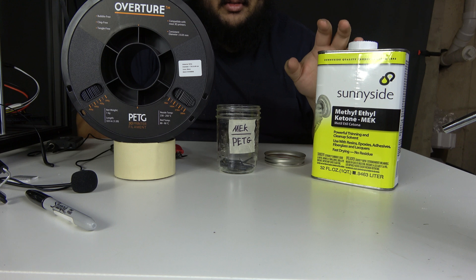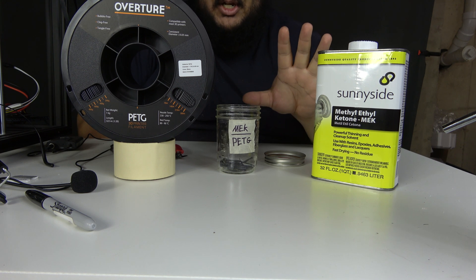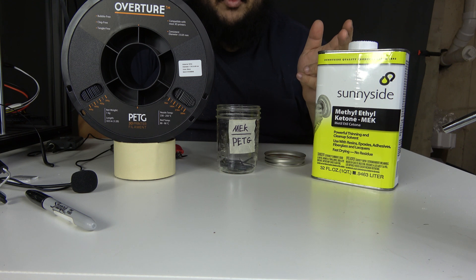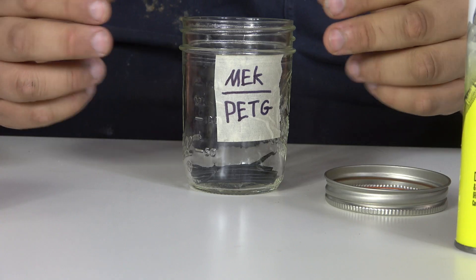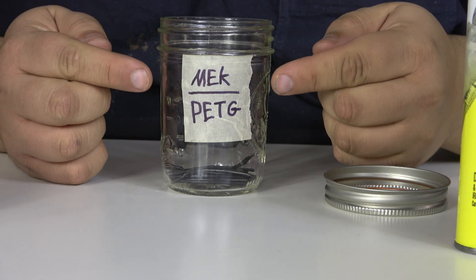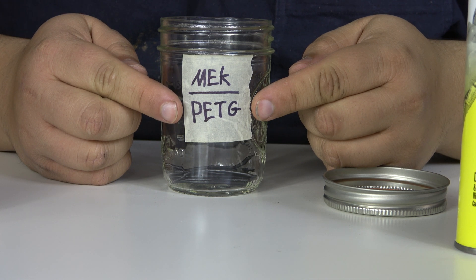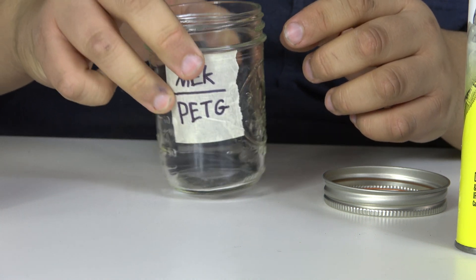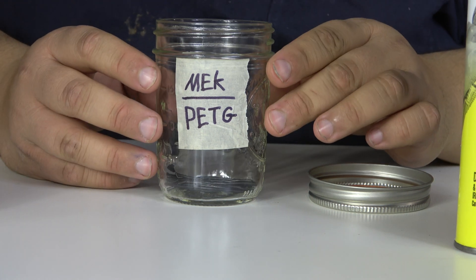To put it quite simply, this stuff is dangerous, so don't go messing with it. If you live in some countries outside of the United States, there's even a chance you won't be able to acquire MEK as a consumer. So today I'm going to be doing the science for you. We've got a glass mason jar labeled with the chemical we're using and the type of thermoplastic we are trying to dissolve. We've got a bunch of strands of PETG in the glass container, and it will be completely sealed once we add the chemical.